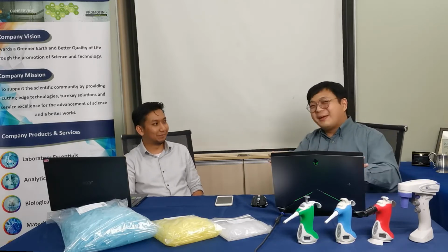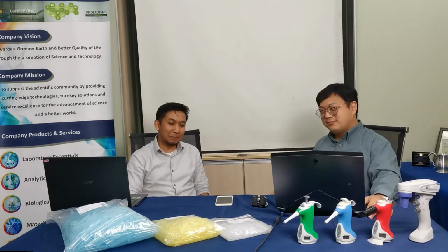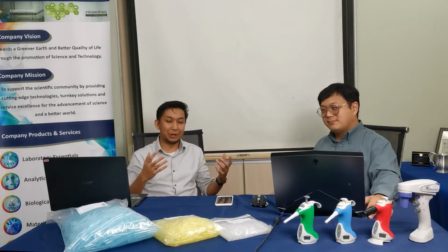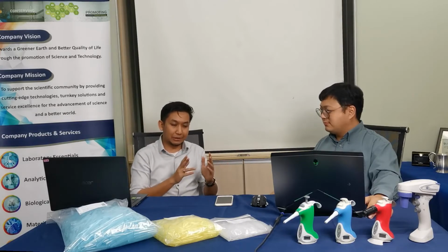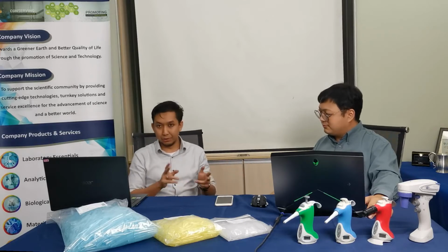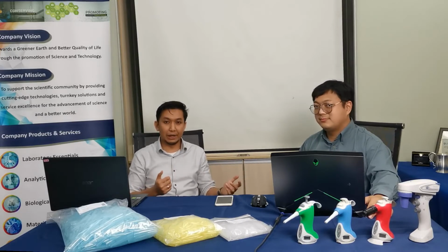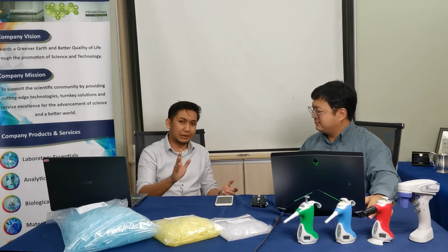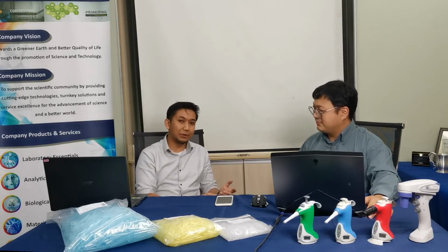But anyway, happy pipetting. Well, as I mentioned earlier today, choosing a pipette is not something like choosing what you're going to wear. The type of pipette you're going to use has to consider what type of research you're doing. Is it relevant or not? Is it suitable or not? All that. Hopefully, from all this, you will get a rough idea what to do. If you are still lost and don't know which one to choose, feel free to contact us. We are more than happy to help you guys.